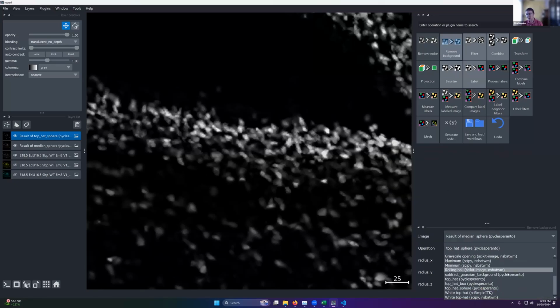But the cool thing about these GPU accelerated ones is I believe if you don't have a GPU, it'll run on your CPU, but everything has an integrated GPU at least these days, and this should work well for that. This also means that when we have large images, like not light sheet large, but 200 megabytes or a gigabyte image, if it can fit into your graphics card memory, then these work fantastic. So it can really accelerate your processing.